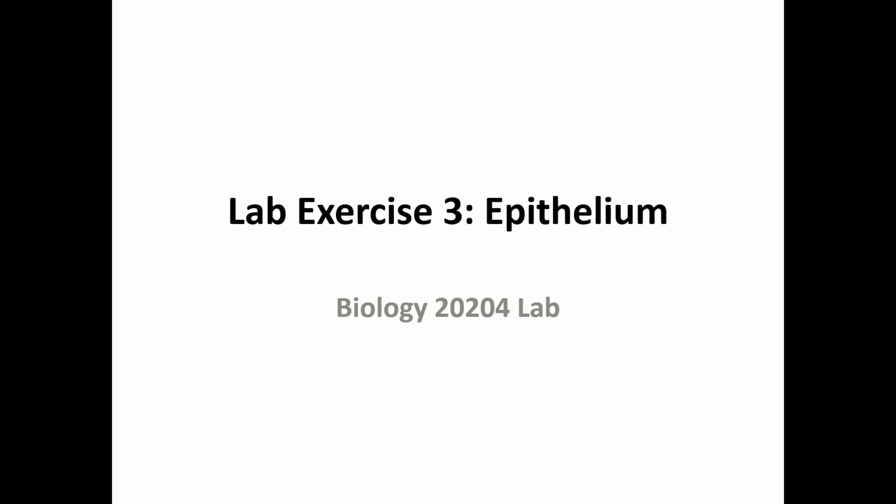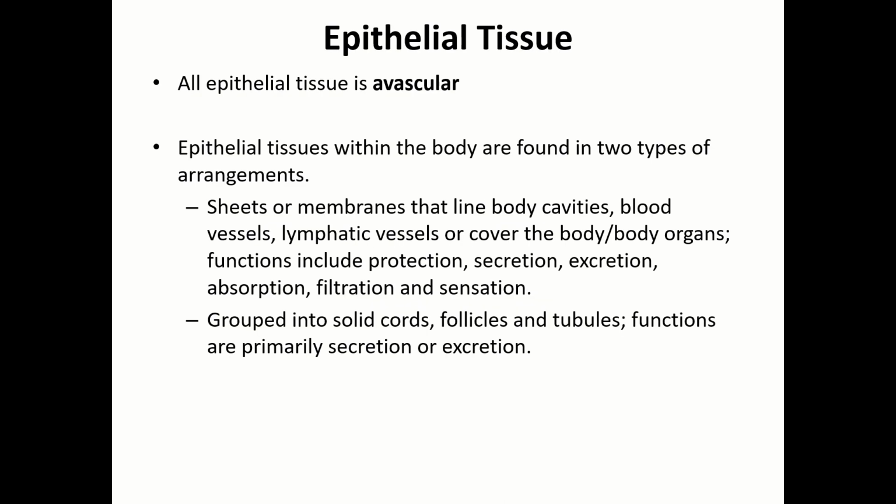In this video, we're going to be discussing the tissues associated with lab exercise 3. This week in lab, you'll be looking at tissues associated with both epithelial and connective tissue classes. This is the first of 2 videos you should watch prior to lab. In this video, we'll only cover epithelial tissue. The second video will cover connective tissue.